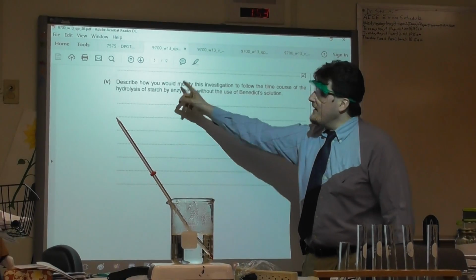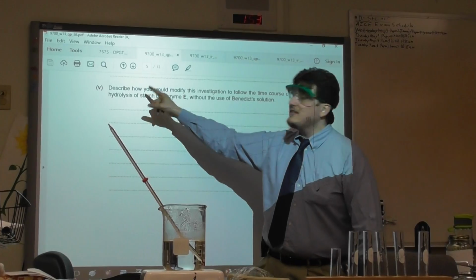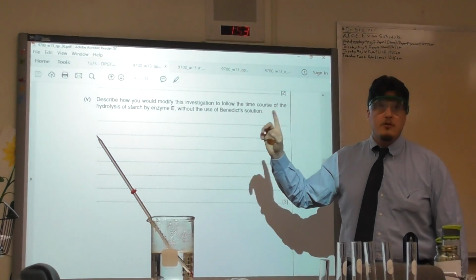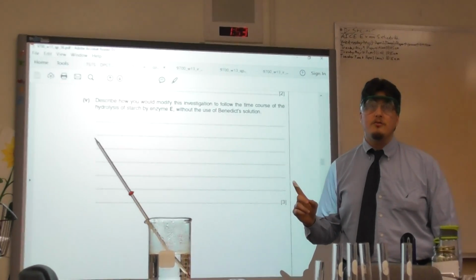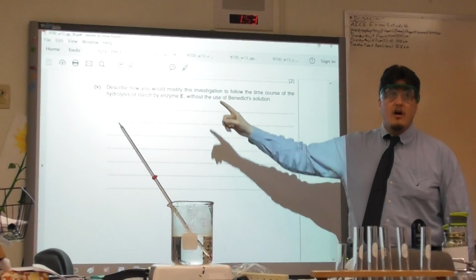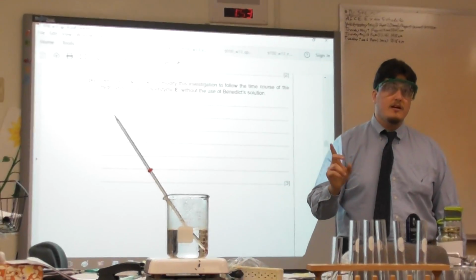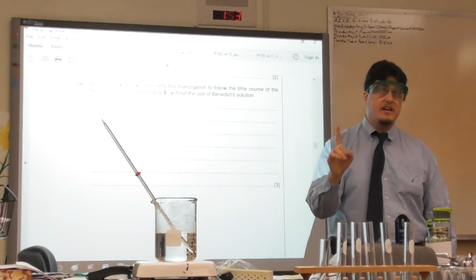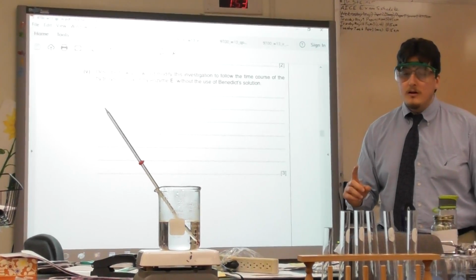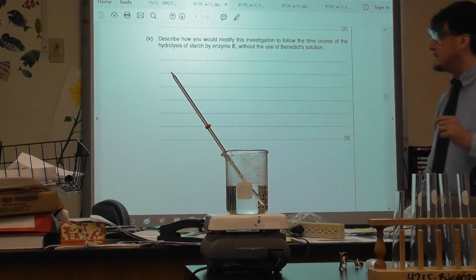Remembering that enzyme E is amylase, that amylase breaks down or hydrolyzes starch. What other test for macromolecules do I know of? Tests for starch. And that's not a question for the peanut gallery to answer. That's a question for the watcher of this video to answer. And if you haven't answered by now, perhaps editing in post will just flash it right here on the screen.